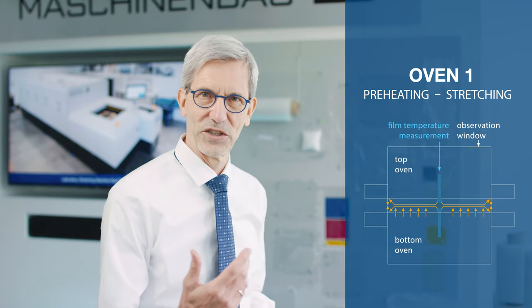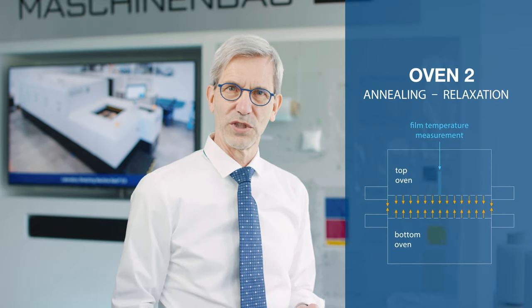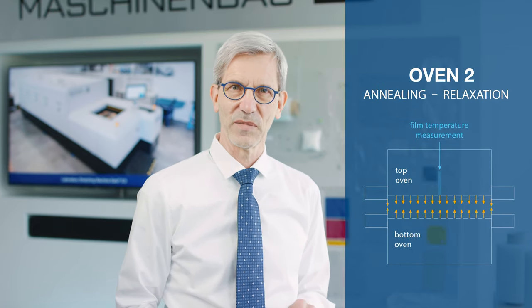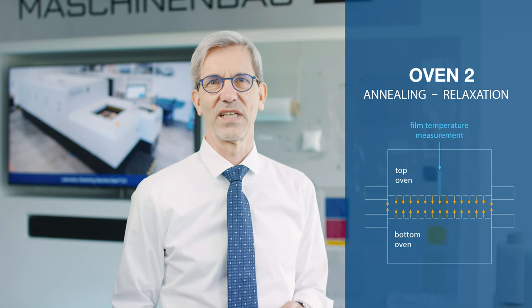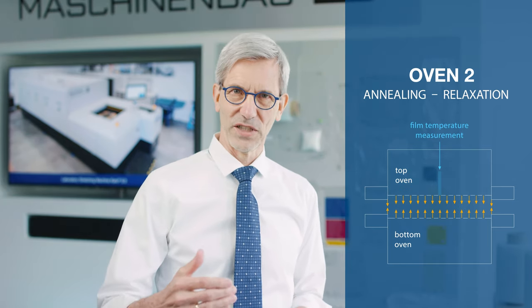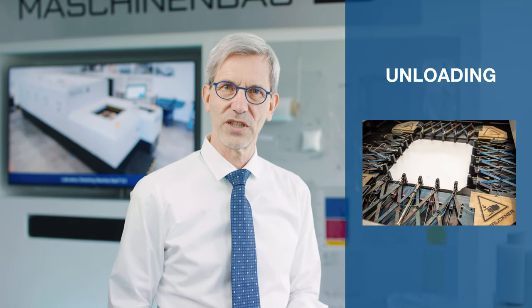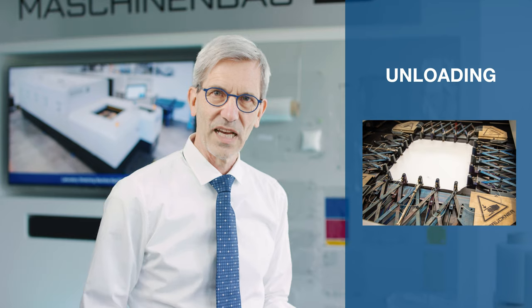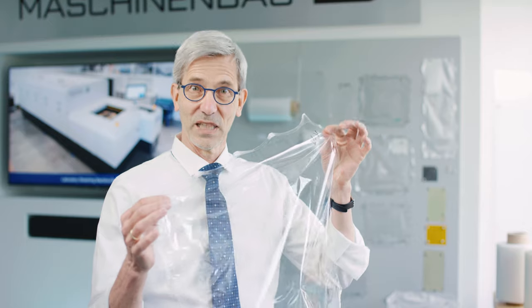After the stretching is finished, the tenter will be driven into the second oven, which usually has a different temperature. Here the film can be annealed and relaxed if necessary. After the procedure is finished, the tenter returns to the inlet position, ready for the operator to remove the sample, and this is what the result looks like.